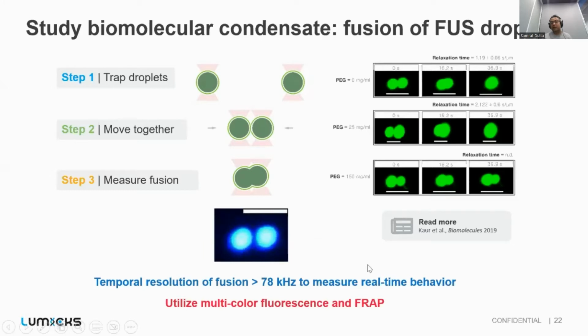But when they put PEG in the solution, they found out that the affinity of these two droplets to fuse onto each other was diminished in the presence of PEG.